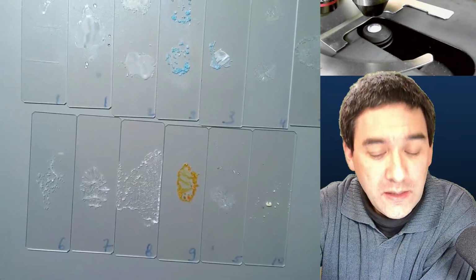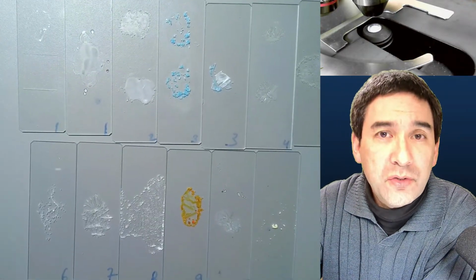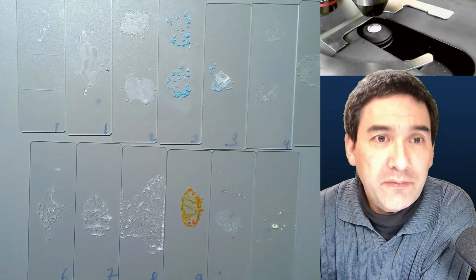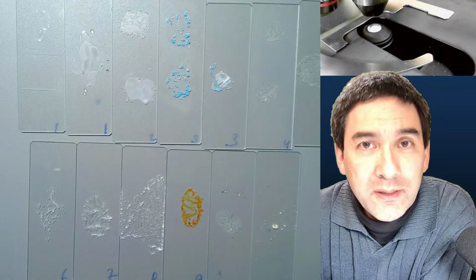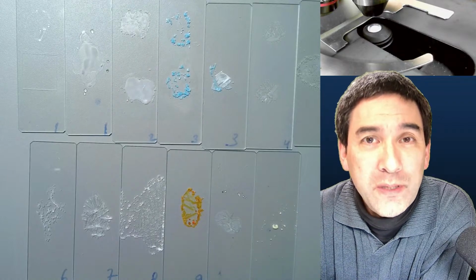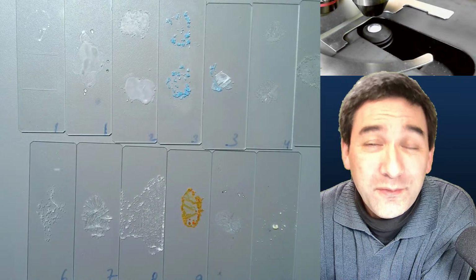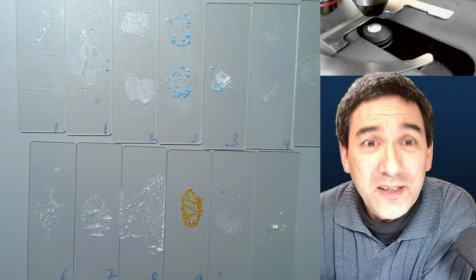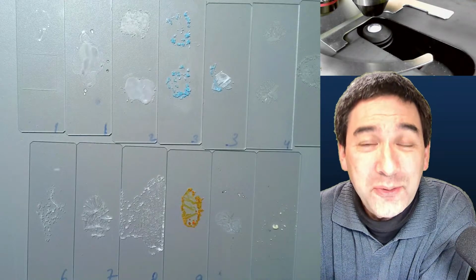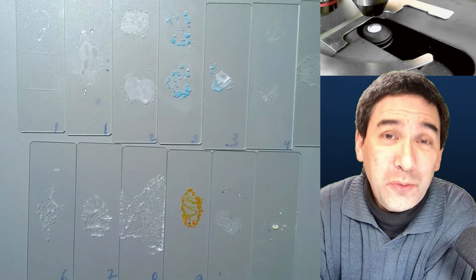So I made those slides here a few hours ago, and I would like to simply show them to you and give you a little bit of advice if you also would like to try a little bit of crystallization. It's not the first time that I show you how to make crystals to be looked at under the microscope with polarized light. I've made several videos already, but I've never used so many different substances as today. So this was also a new thing for me.